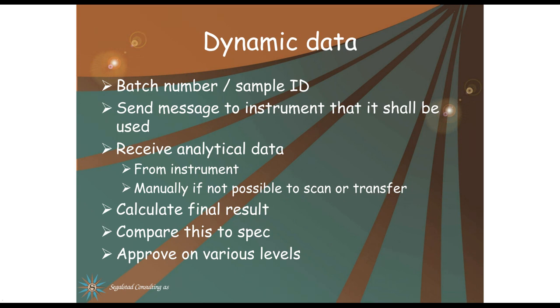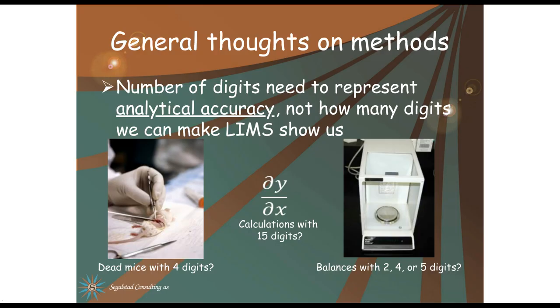Flags can be set for maintenance, calibration, expiration dates, problems with system suitability testing, out of range for instruments, out of spec for results, to mention a few. A GXP sample should always have a final approval by a qualified person like someone in QA, and LIMS does have that technical function for electronic signature.